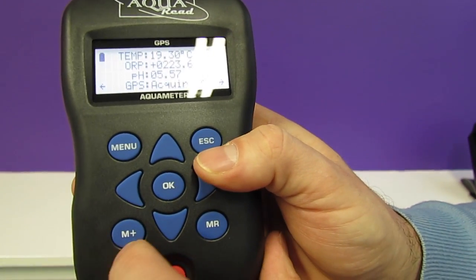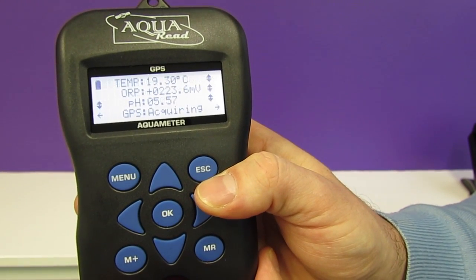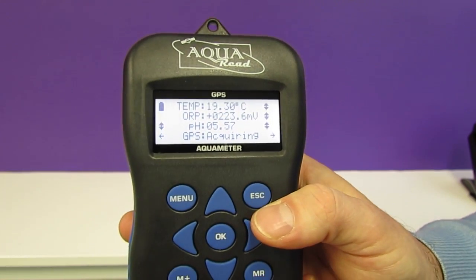You can record data by pressing the M plus button. That's all you need to do to record the entire data set and also the GPS coordinates of your current location.